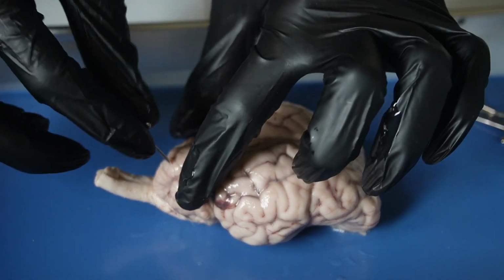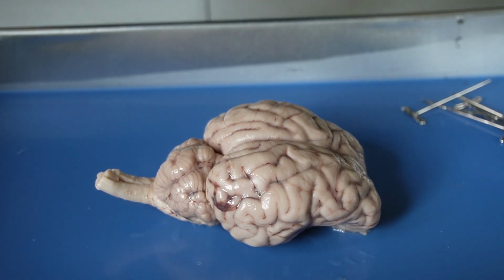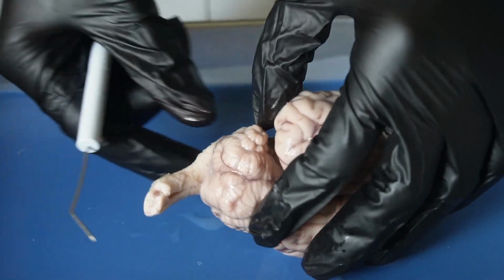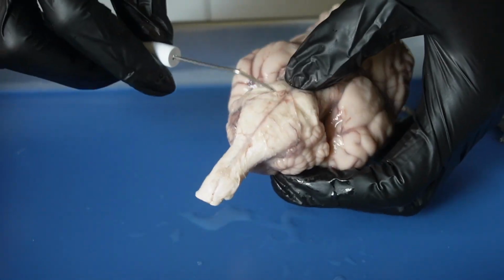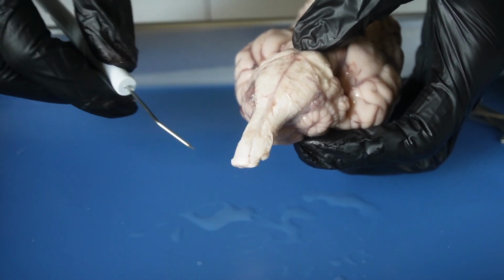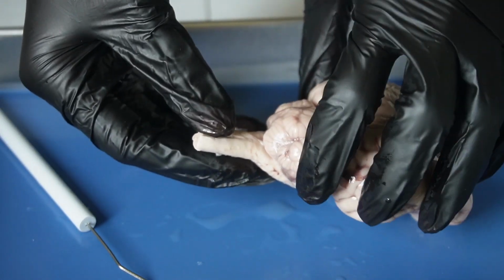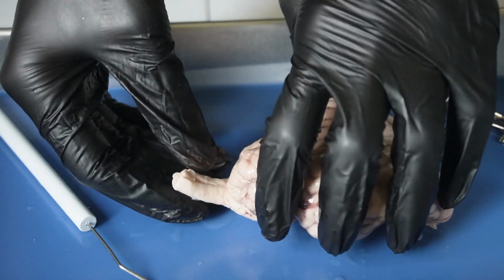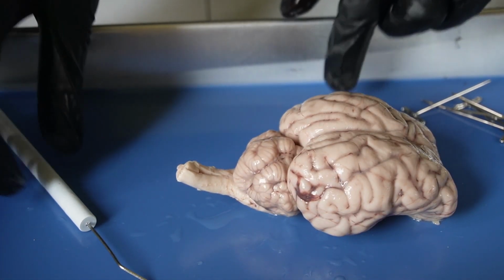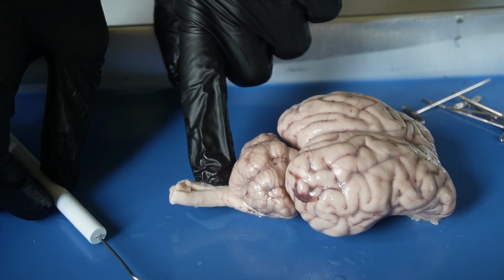And then last but not least is the brain stem, which is here. The brain stem contains the pons, the medulla oblongata, and the spinal cord. Its function is to facilitate, it helps us with our sleep, our breathing. It helps us to regulate our body temperature as well as digestion.